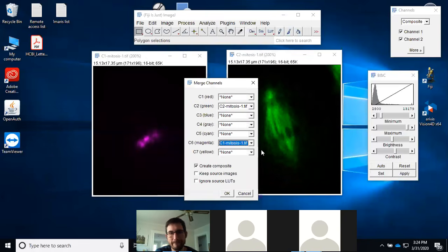Doc? Yeah. Hi, Doc. Can I ask a question? Sure. Speaking of the denoising or smoothing the images, what is the difference between Gaussian blur and the median filter? Is there any difference between these two methods?